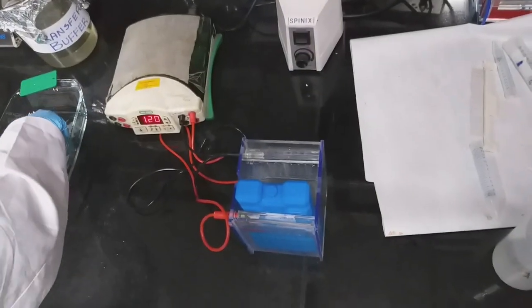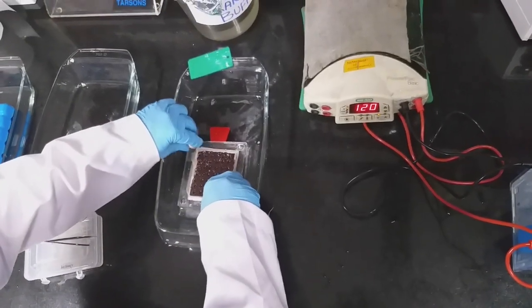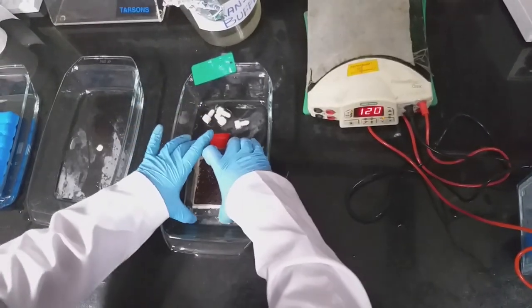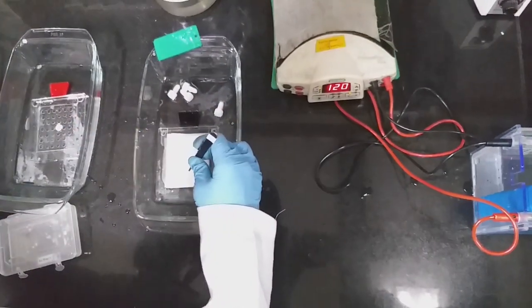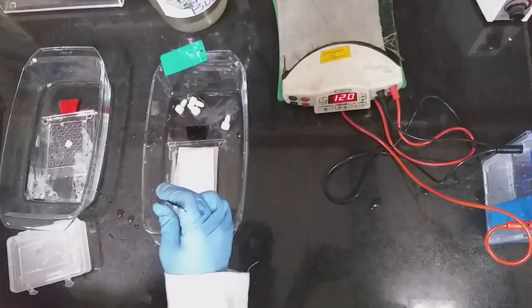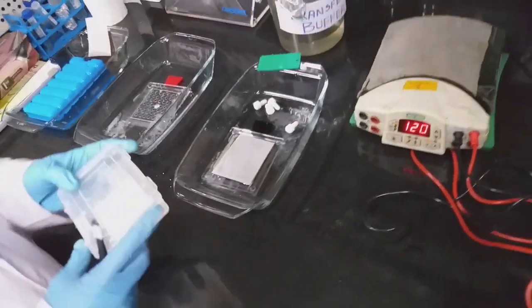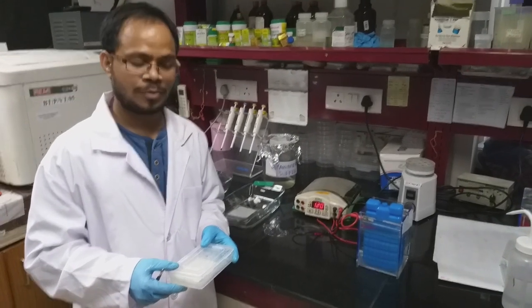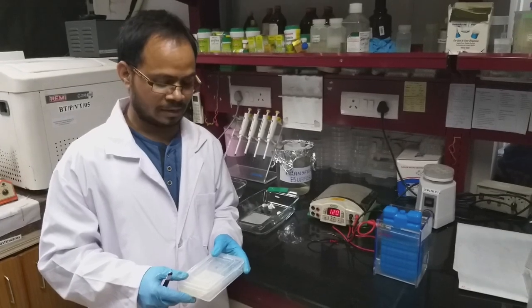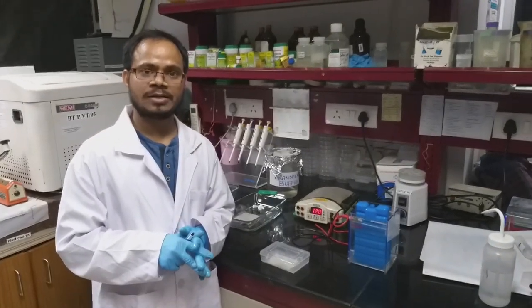Remove the cassette. Keep it in a tray. Remove the screws properly. Gently remove the sponges. Take out the blot and keep it in blocking buffer. In this condition we have to keep it. If you are keeping it at room temperature, it is for at least 2 hours. If you are keeping it at 4 degrees Celsius, you can keep it overnight. The blocking buffer contains skim milk or BSA along with Tween 20.